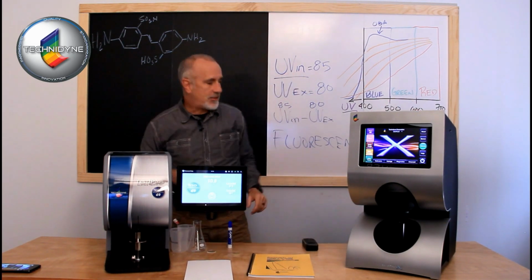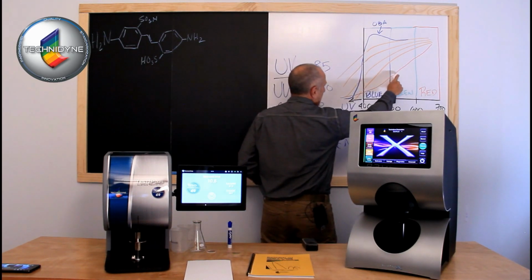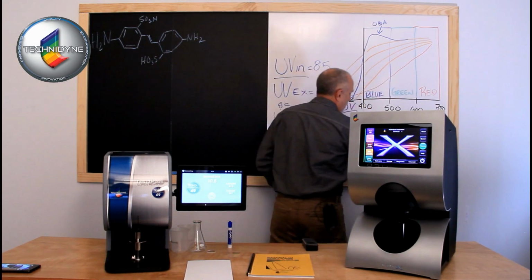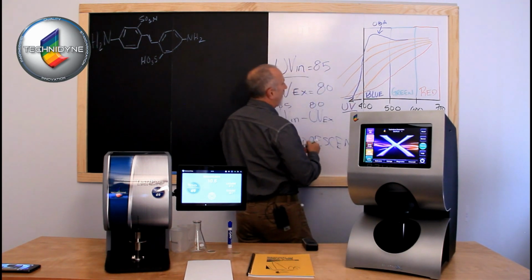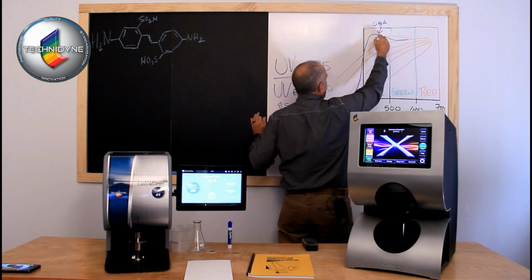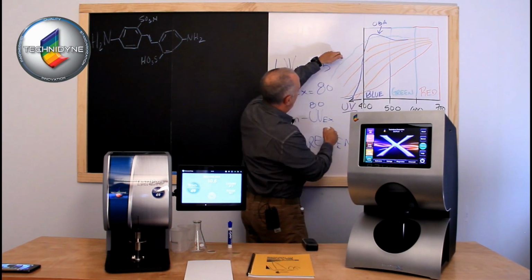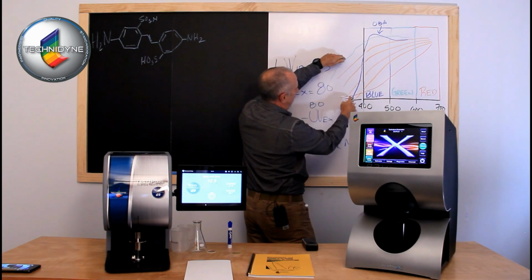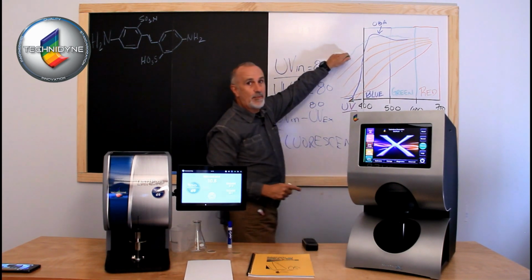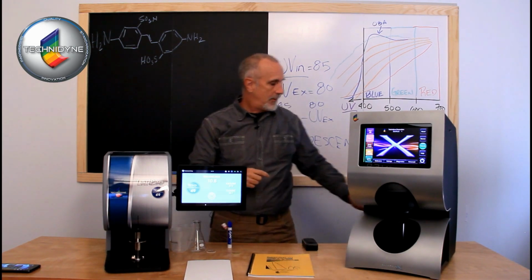So, again, this is an approximation here, but if you think of this being a QTH light source, a xenon flash lamp light source might have energy more like that. So you're going from an energy differential from here to here. And that would be somewhat consistent with outdoor daylight, so it's a very rich light source.